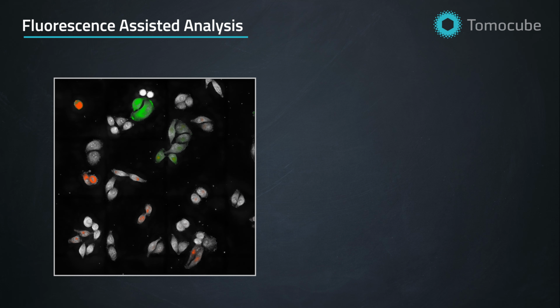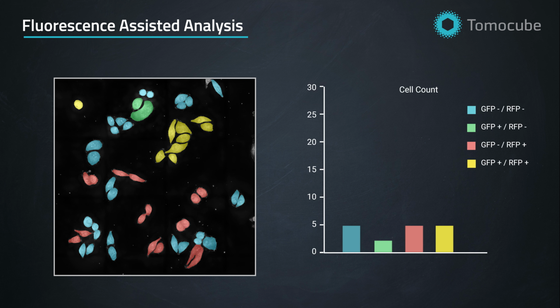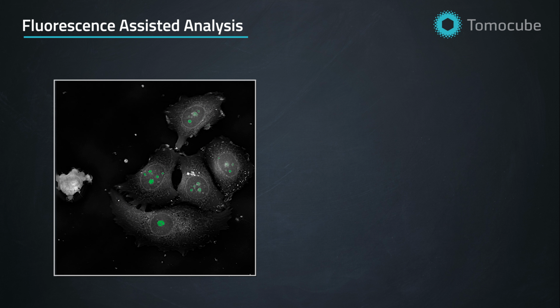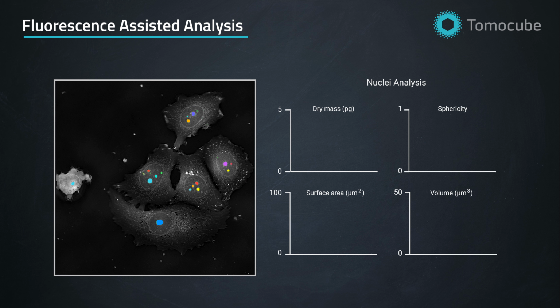Integrate fluorescence signals with refractive index-based analysis for multimodal insights. TomoAnalysis enables precise localization, quantitative measurements, and dynamic tracking of cells and subcellular structures, combining biophysical insights with conventional fluorescence data.